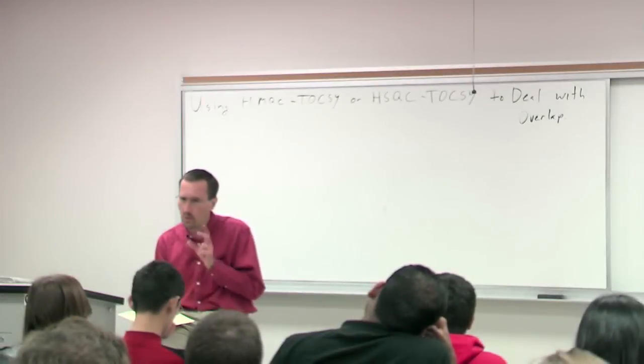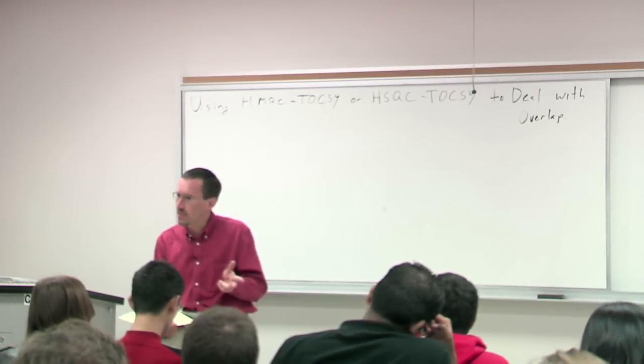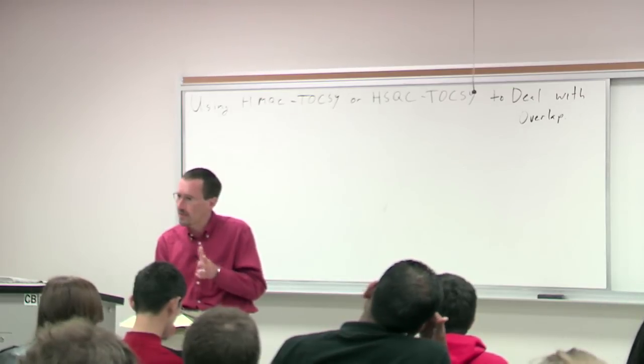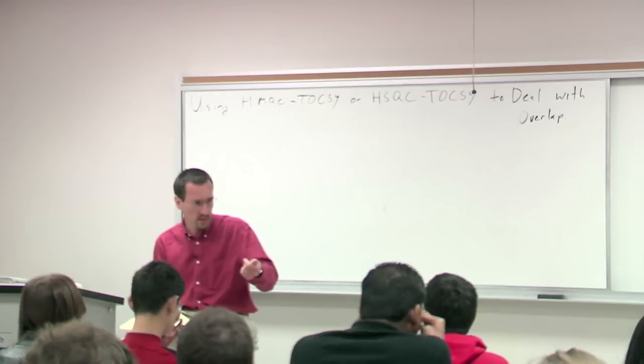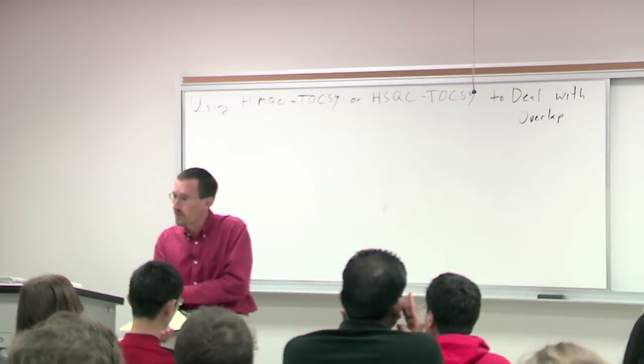Heteronuclear single quantum correlation. For all intents and purposes, they give you the same information. The HSQC technique requires phasing. Remember what you did, you phased on your NOESY spectra, right? On the 2D, what did you do? You phased on the NOESY, the 2D phasing?